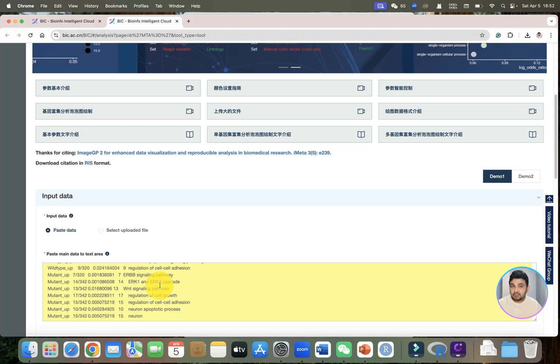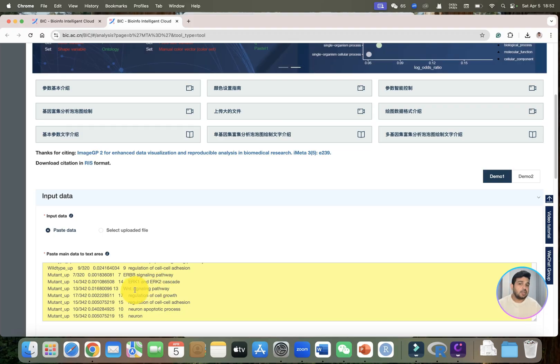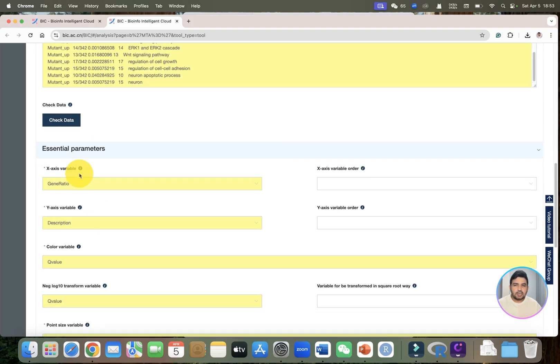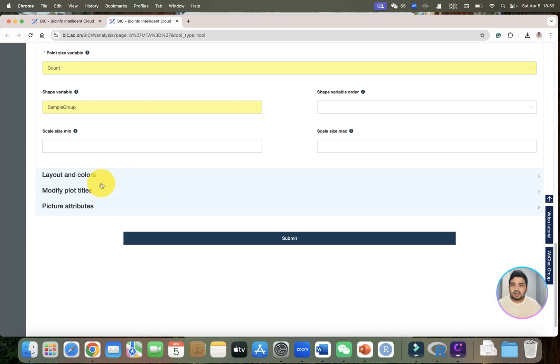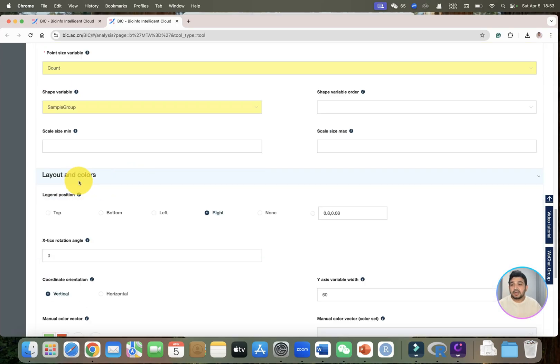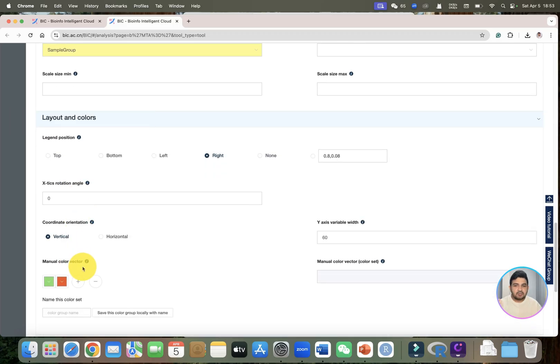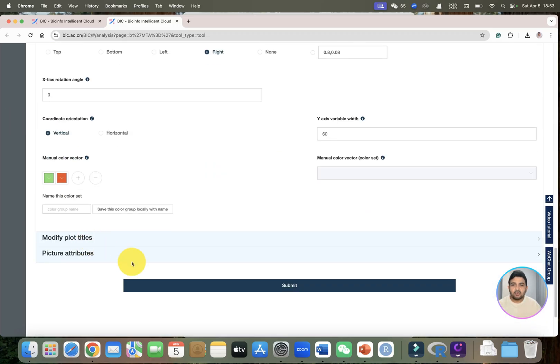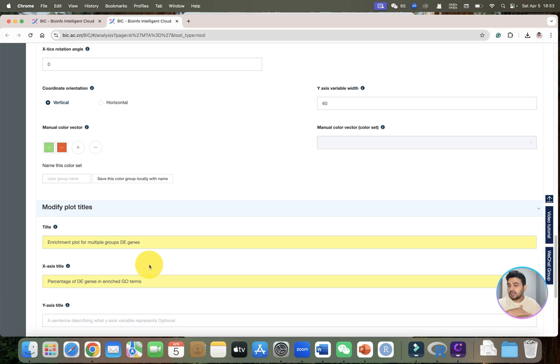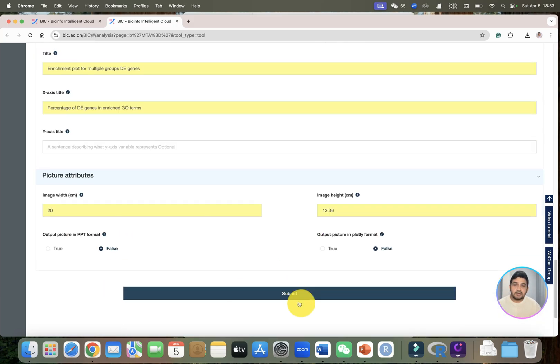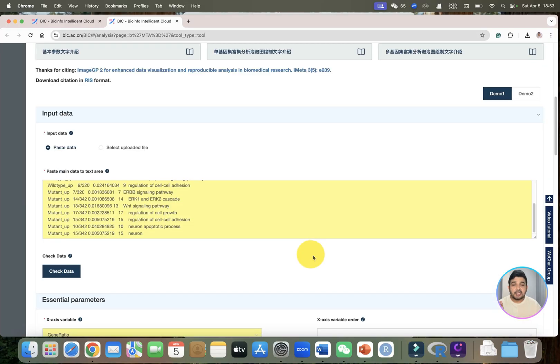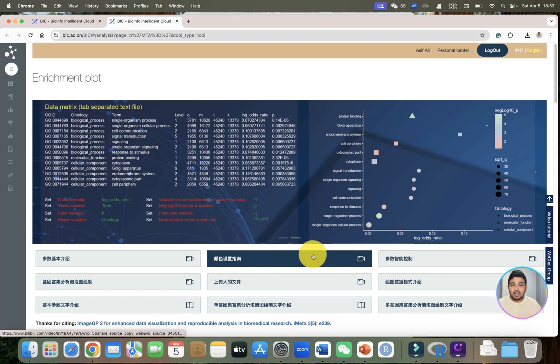You can use the demo data or transform your own file accordingly. With this, you can set your essential parameters — what you want on the x-axis, what you want on the y-axis. Similarly, you can adjust layout and colors, manual color vectors, and modify different titles for x-axis and y-axis.